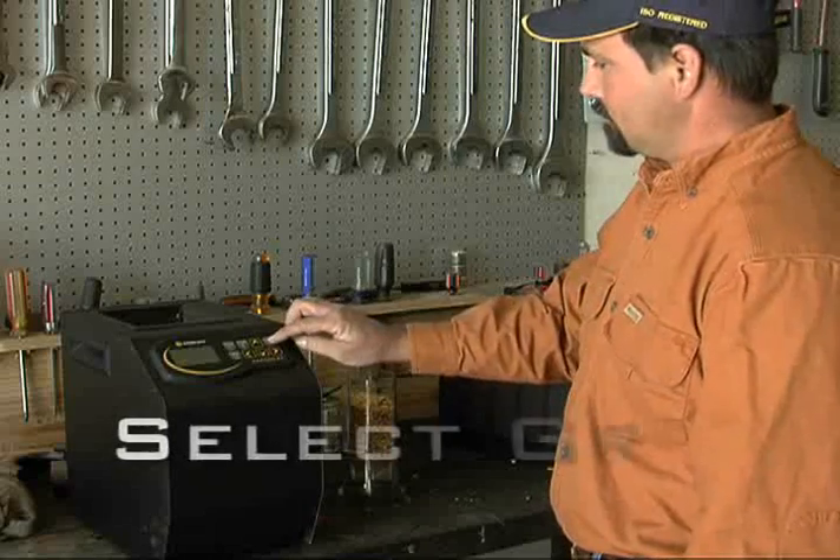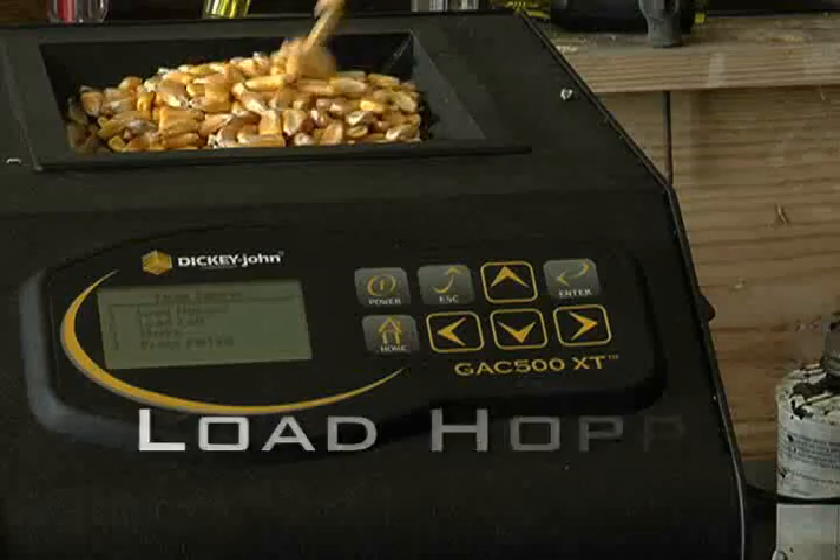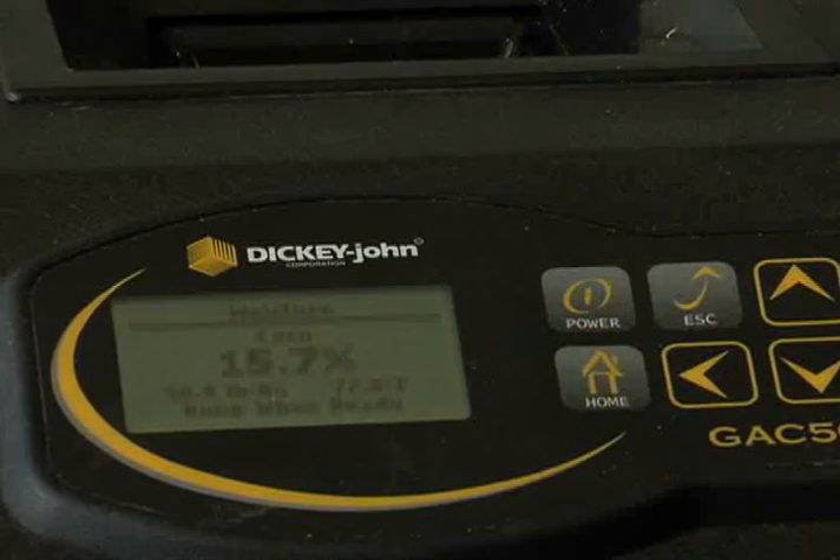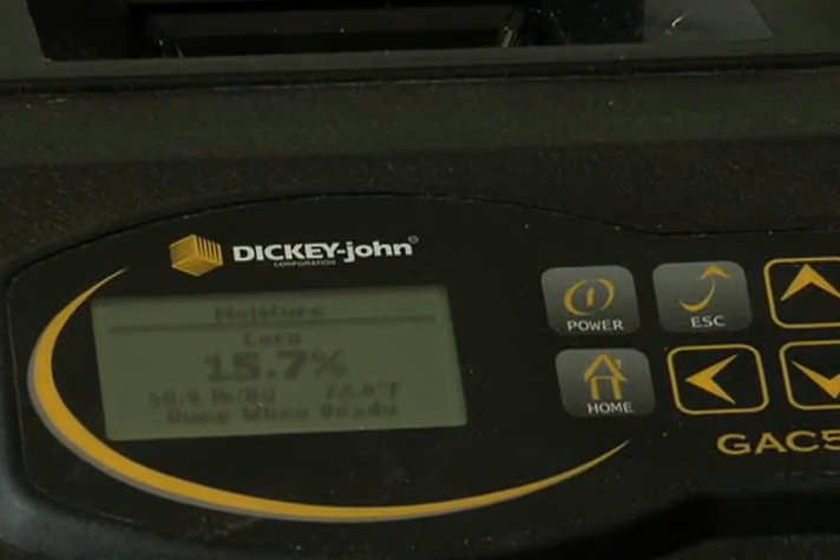Plus, it's easy to use. Simply select the grain, load the hopper, pull, slide, and strike grain, and press enter. You'll have results for moisture, temperature, and test weight in about 25 seconds.